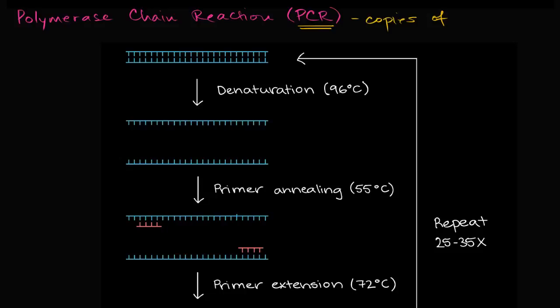And so why would you need to make a lot of copies of a particular fragment of DNA? So you might want to be making lots of copies so that you can clone it into a plasmid and then do some other experiments with it. That's a big use. So when we talked about cloning and we're talking about sticking a fragment of DNA inside of a plasmid, it's not like you're just taking one fragment into one plasmid. You're doing that with many, so you need a lot of fragments of DNA. Exactly. That is exactly it. And you might start with a very small sample of DNA.